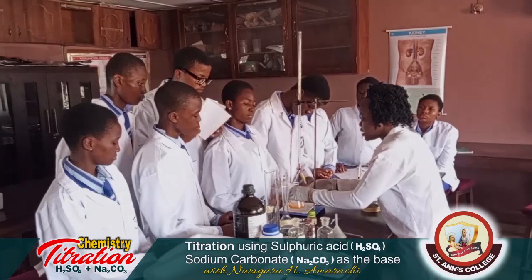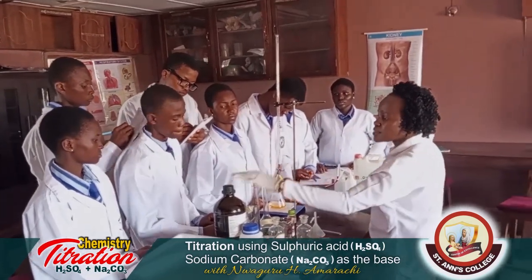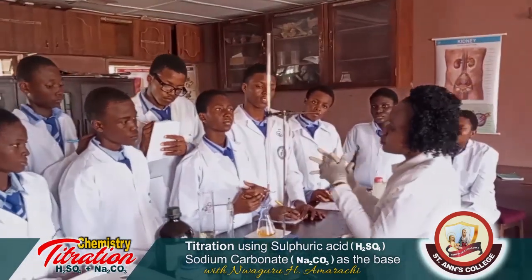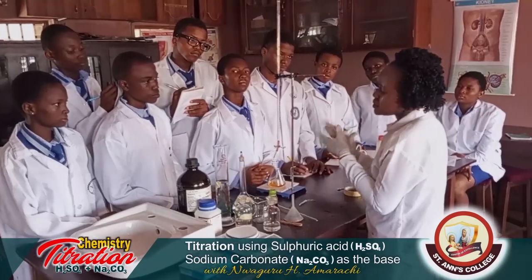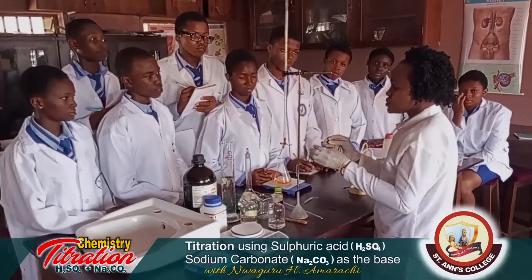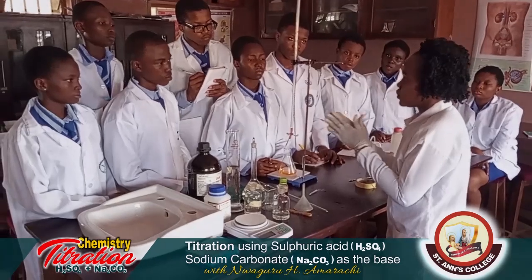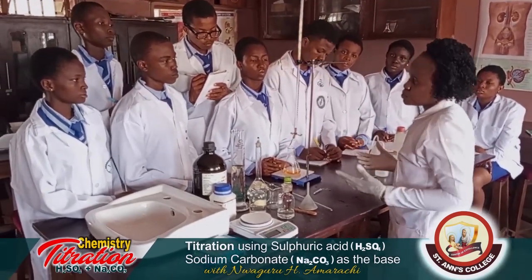That's another precaution. You know very well that you are making use of a concentrated acid. So when handling a concentrated acid, your protective measures are highly needed. Wear your hand gloves to avoid the acid touching the skin on your hand, because it is very corrosive and dangerous. Then your lab coat.